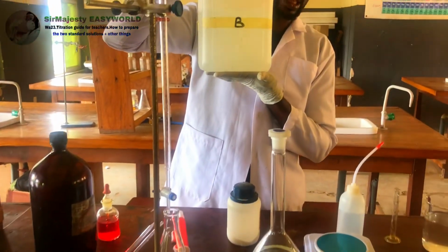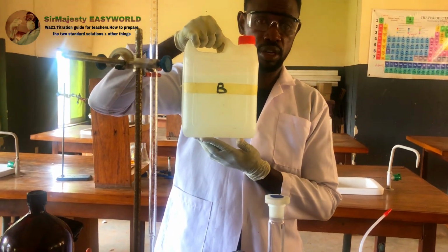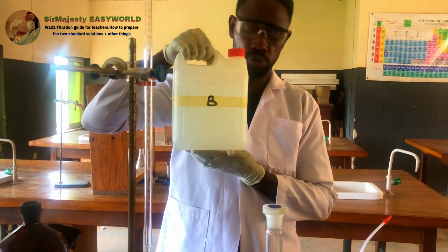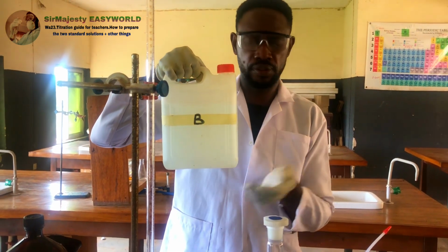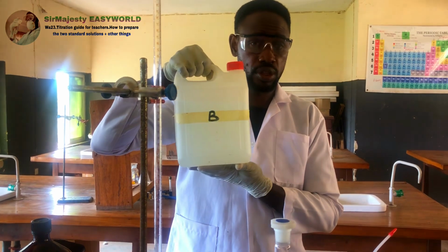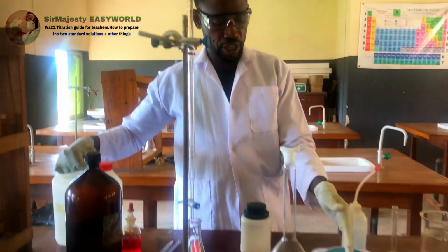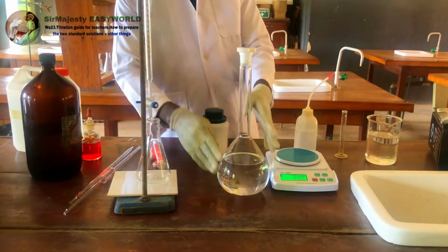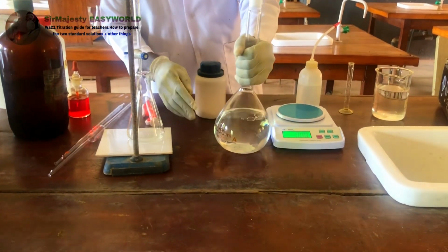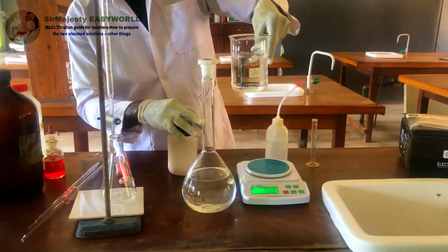I finished preparing my B. This is 3 liters of B. This means I'm actually ready for my students, even though they don't know. You might not reveal this to your students, but if you didn't train them well, you can, because they might go there and mess up. So if you measure that 5 grams, you dissolve it in some volume of water like this and shake. After dissolving, you use more water and add it up to this level.